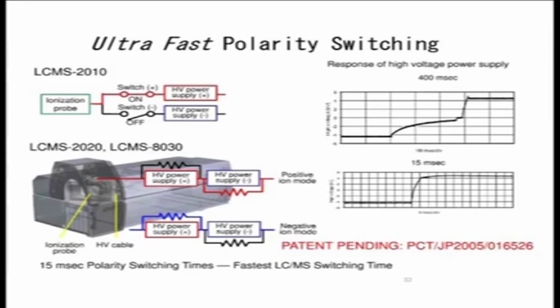Okay, therefore you require the polarity switching time to be very fast, so that you can analyze both the positive and negative modes simultaneously, and you can detect the data.